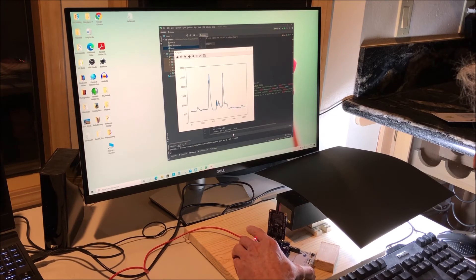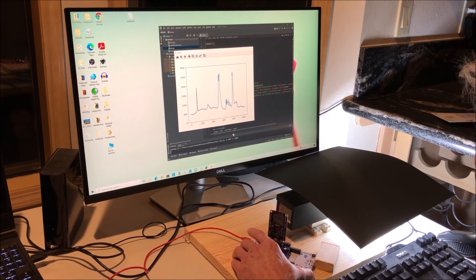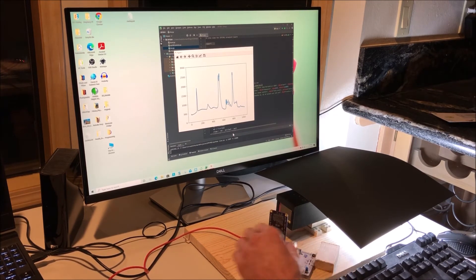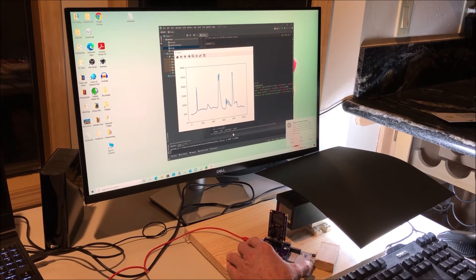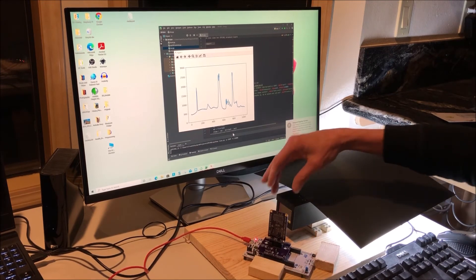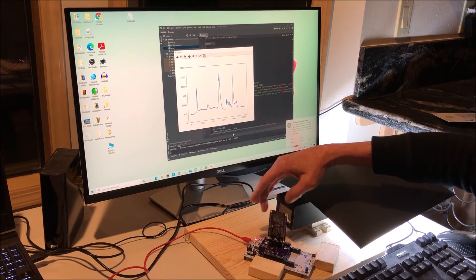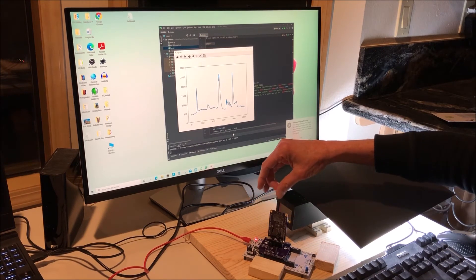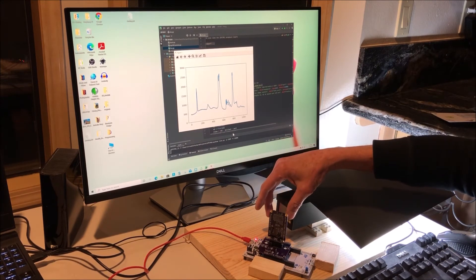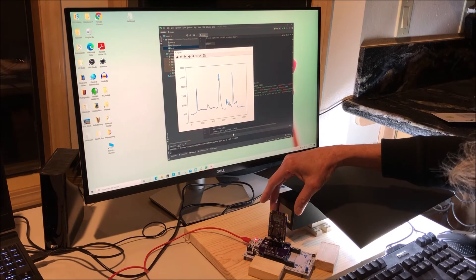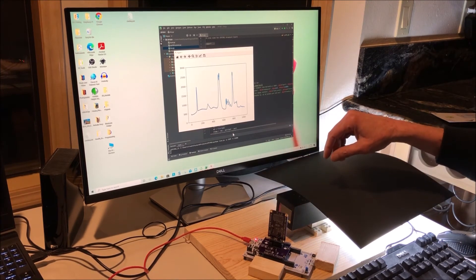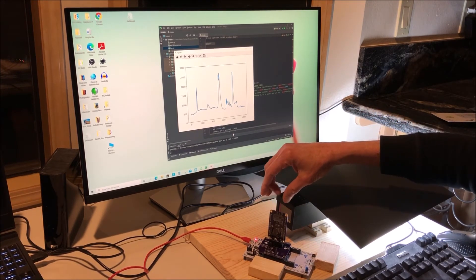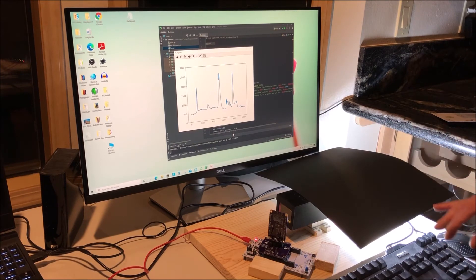It's eased greatly by the fact that I've set up these wooden blocks and glued them down that allows me to align very quickly. If necessary I can also adjust the lens back and forth to get better focus, but right now we're in pretty good focus so I don't really need to do that adjustment.